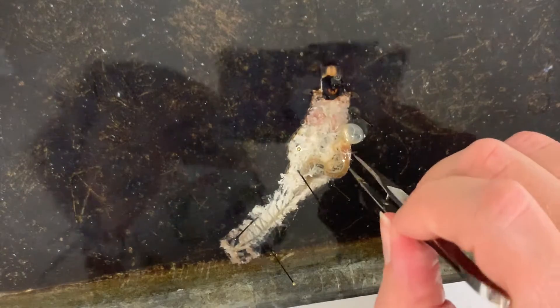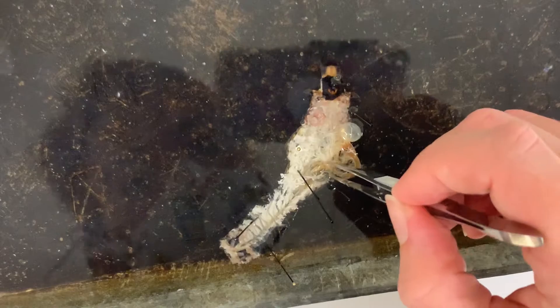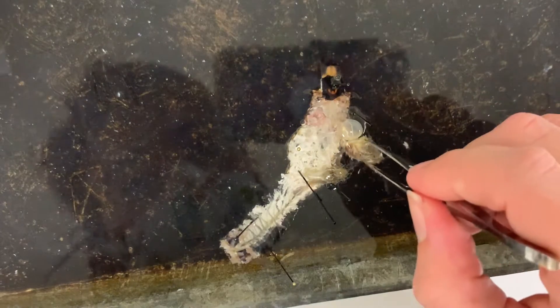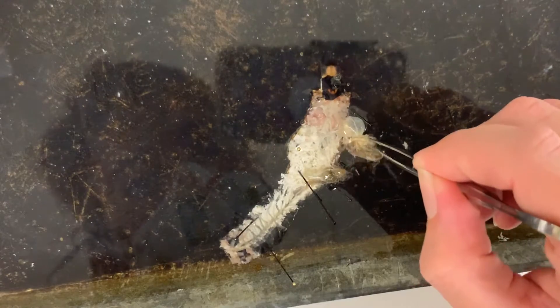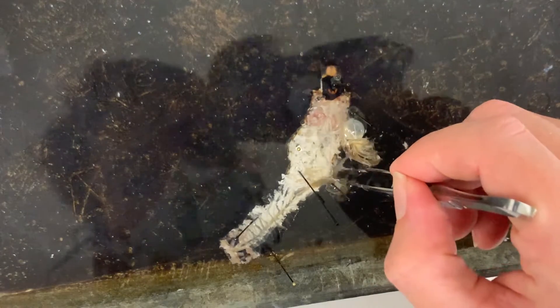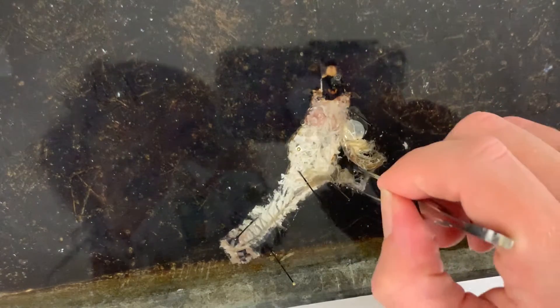I'm going to pull pretty hard because this is going to come away pretty nicely. It looks like the Malpighian tubules actually. Here's where the Malpighian tubules are attached down here.